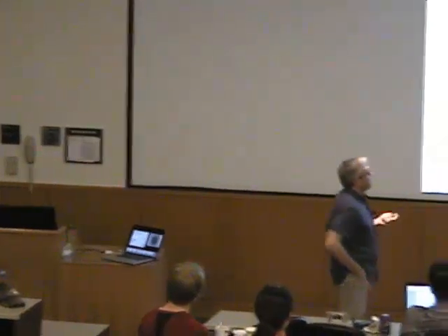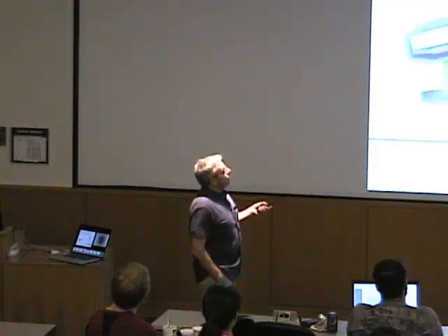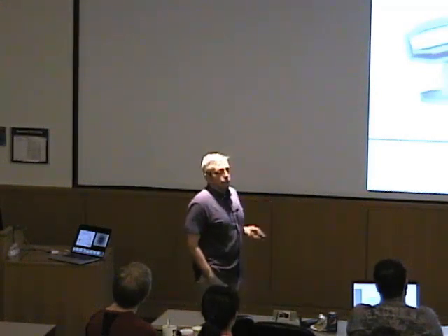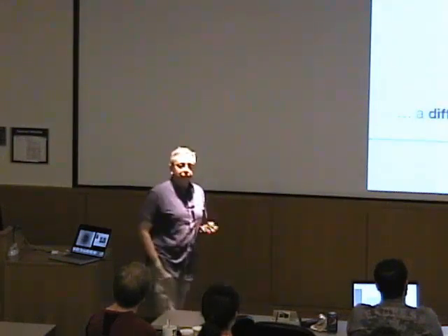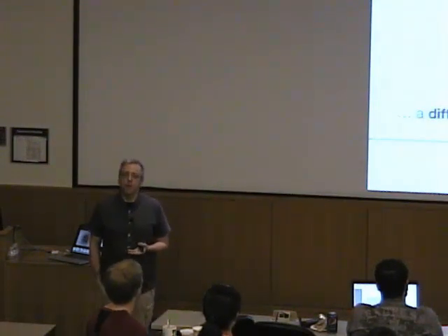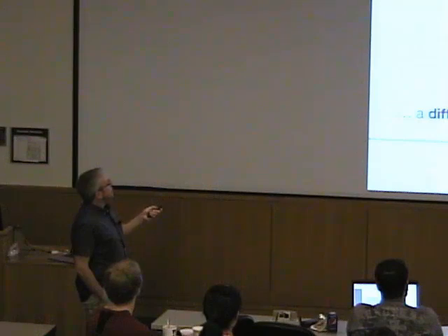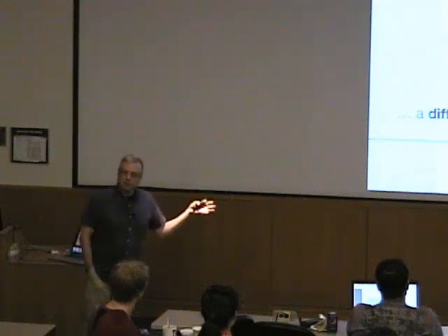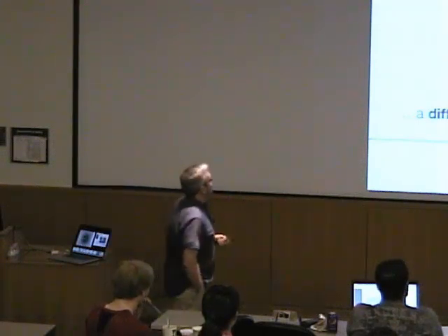It's light waves. You don't have a charge like for an electron microscope, and all you can do is basically look at what happens in the diffraction process and wonder what to do about it. And what happens in the diffraction process is something like this. So you will get pictures of this kind, which are arguably very beautiful, but it's not immediately apparent how the structure of your protein looks, right, once you look at that.